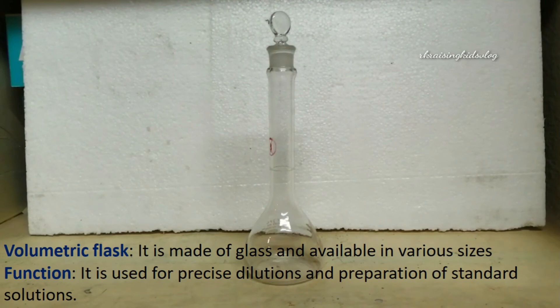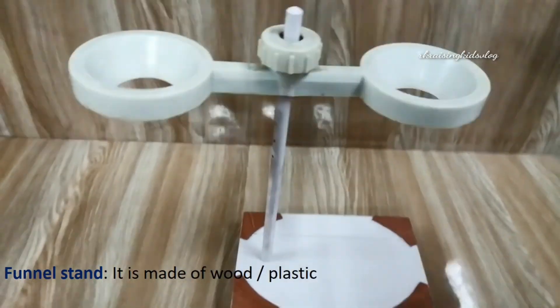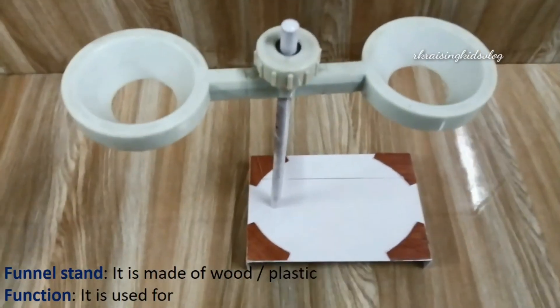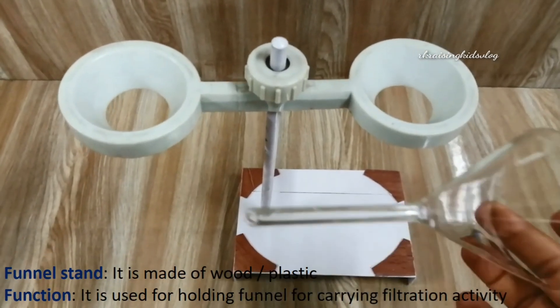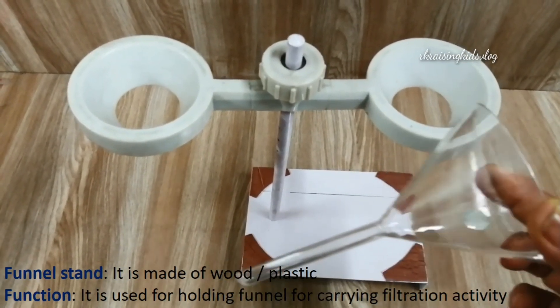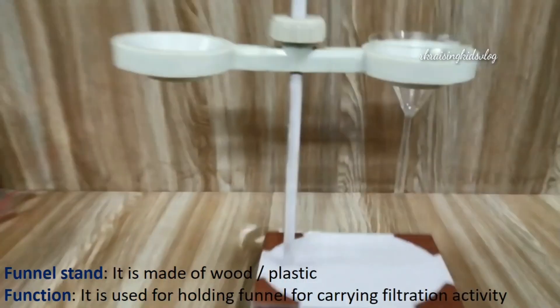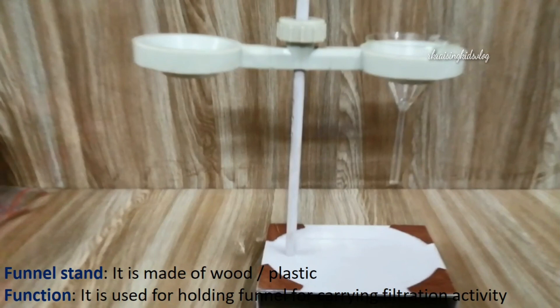By closing the cap on the top, you can mix solutions in the volumetric flask. Next, the funnel stand — this is made of wood or plastic and is used for holding the funnel for carrying out the filtration activity. The liquid will flow down through the funnel into a beaker, conical flask, or similar vessel so that the liquid gets filtered.